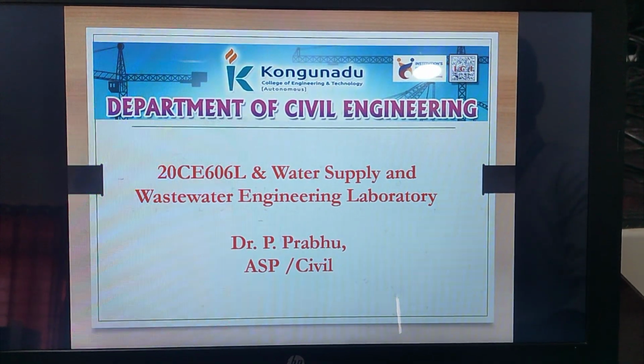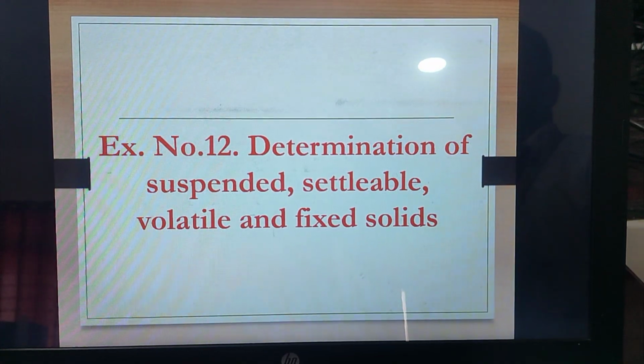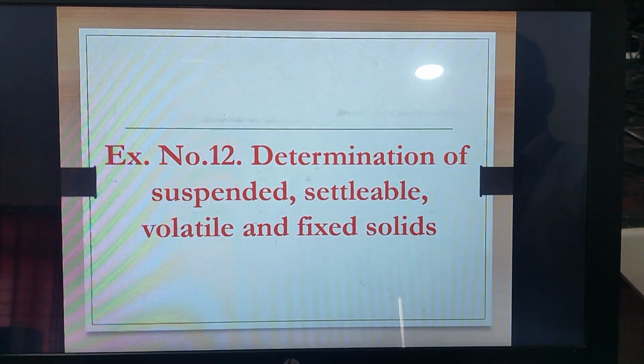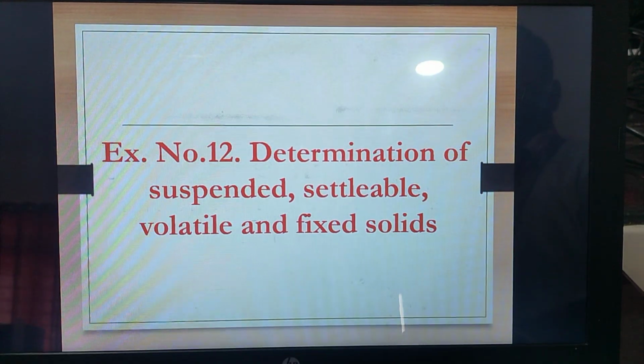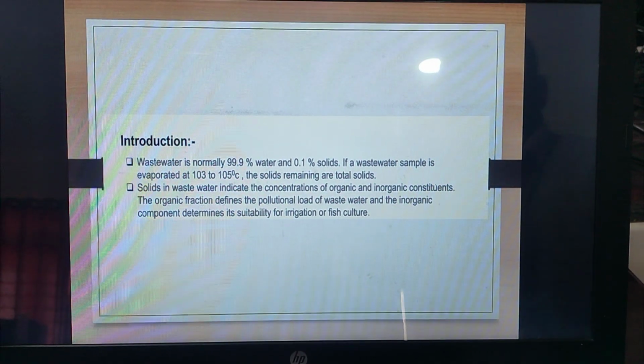So in that series, we are going to see the next experiment: determination of suspended, settleable, volatile and fixed solids in the water. A small introduction about these solids.